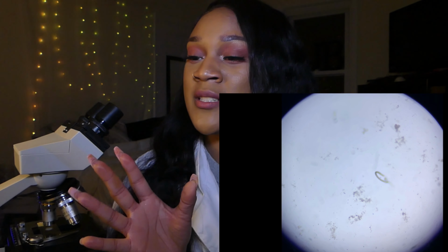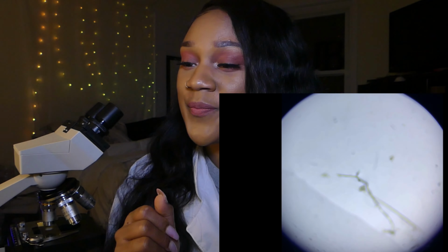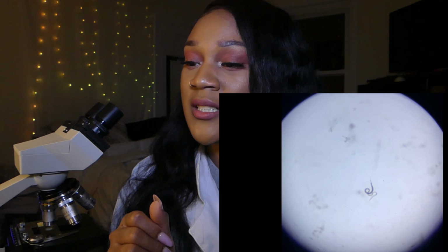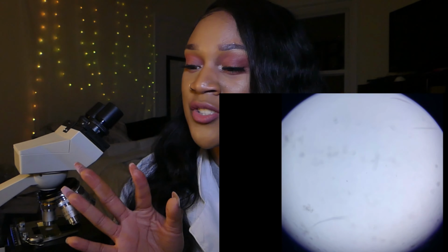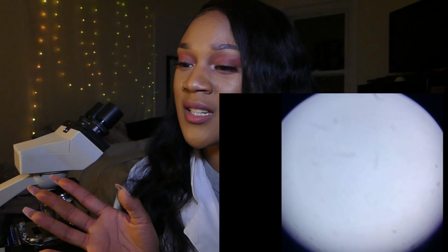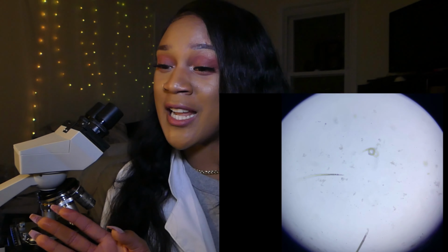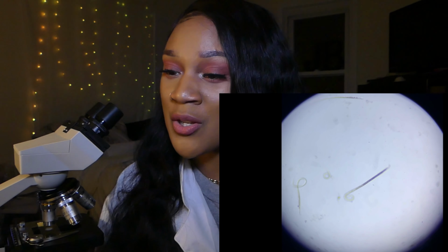This medium-sized one is trying to cling on to life, but here's another dead one. That's a medium to larger size one. And yeah, all of those strings, those are dead vinegar eels. Again, this is the full footage. This is unedited, and this is what, a minute total.